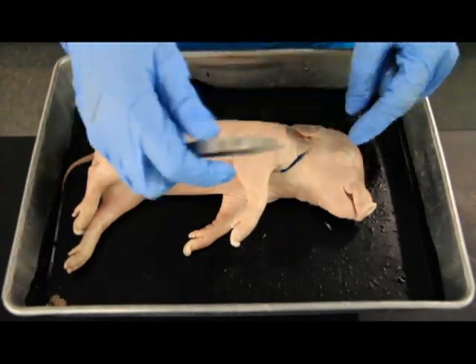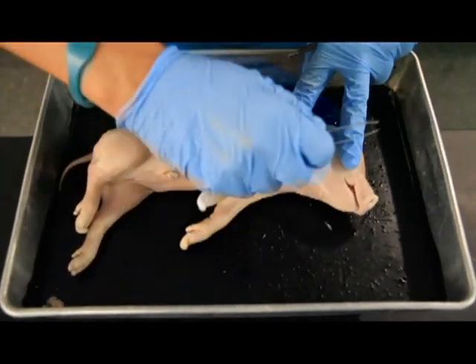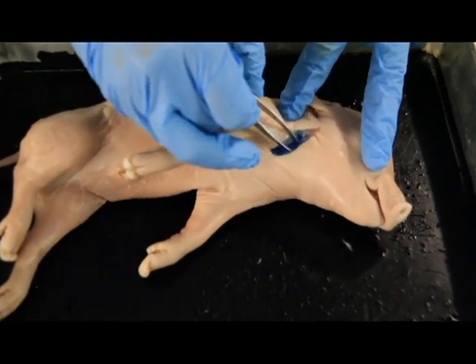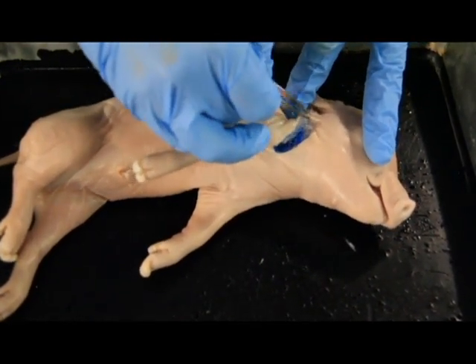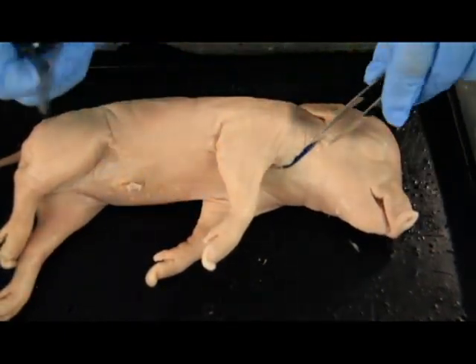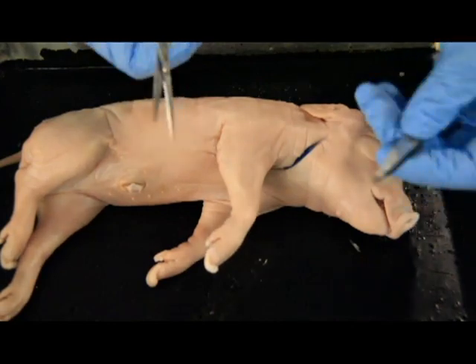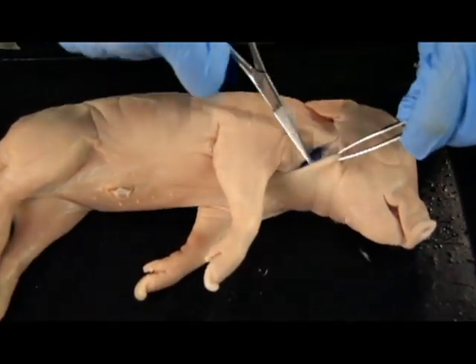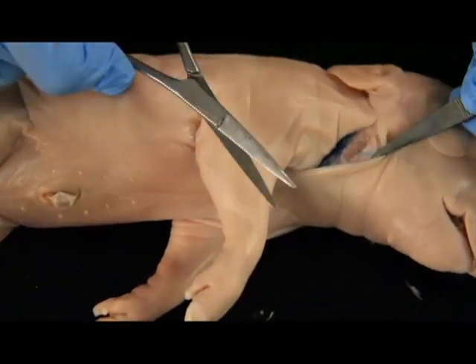So now we know, because we can see in, that we're not really going to hurt anything. All this fatty neck tissue right here, this is all parotid gland. So the parotid gland is very thick, and again, it covers his neck, and this is for protection. So what we're going to do is we're going to lift up, again, one hand with the tweezers, the other hand with the scissors, and we're going to cut just below the skin, right at this connective tissue.